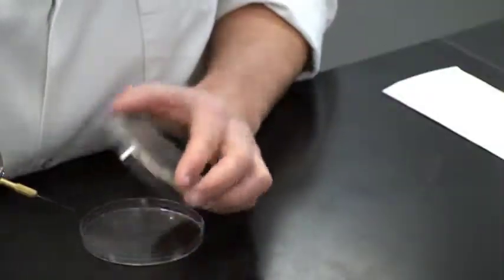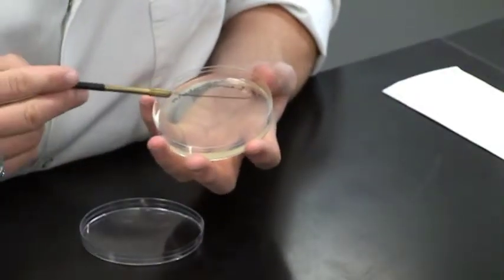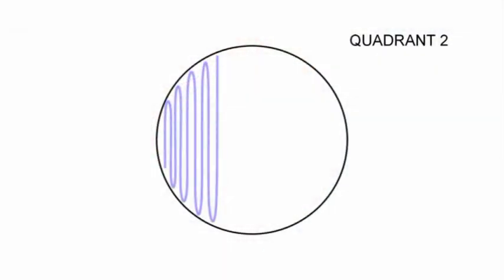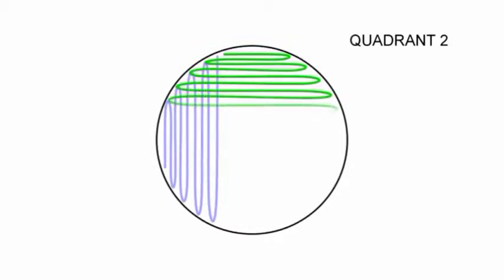Pick up the plate and rotate it a quarter turn to position it for quadrant two. In quadrant two, overlap the first three to four streaks with quadrant one to pick up bacteria. Then complete the remaining streaks with no overlaps.